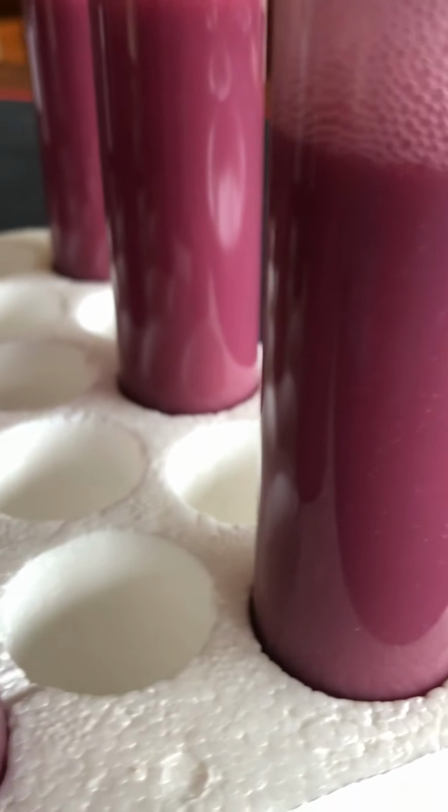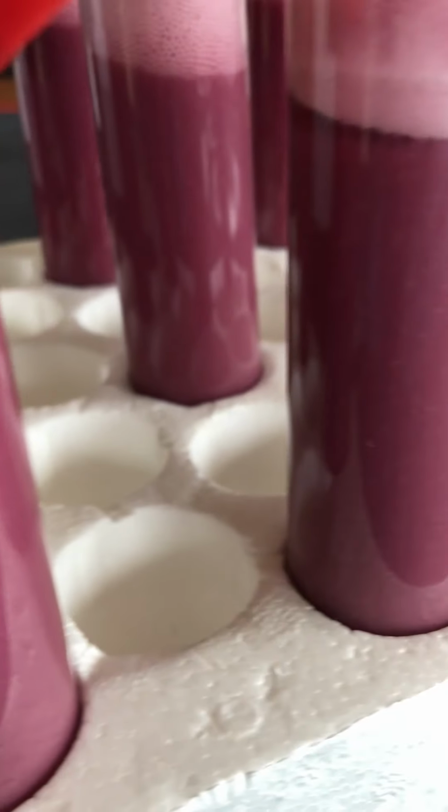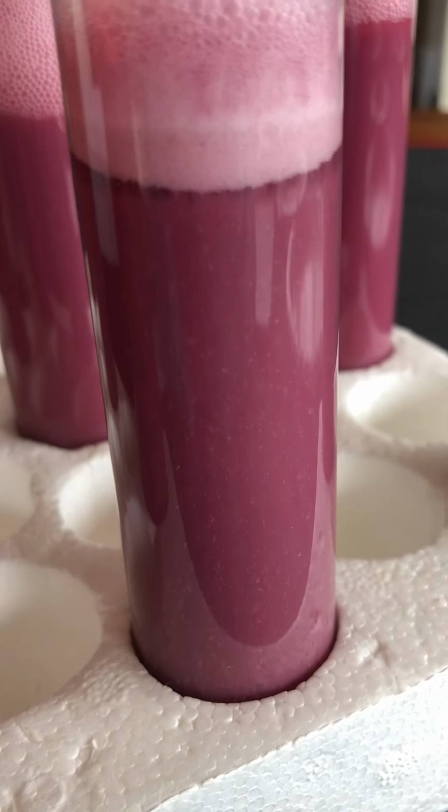And again, this one is closed. So each of these vials has the yeast in it, and the bubbles that are produced through the fermentation process are definitely distinct, whether you have a closed system or the open system where oxygen exchange could occur.